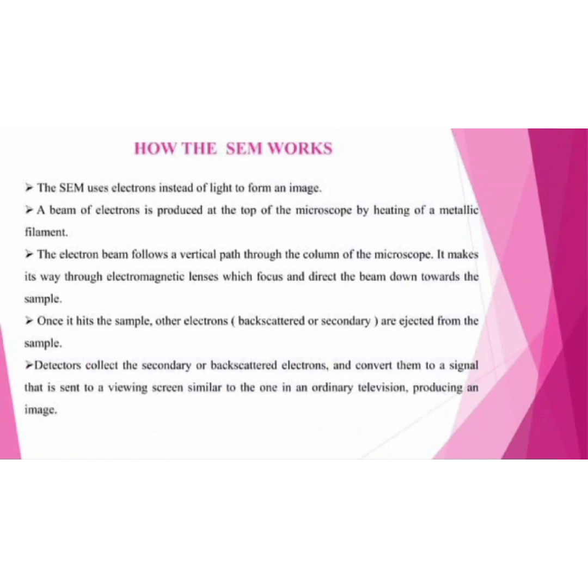Next, once it hits the sample, other electrons are ejected from the sample. Detectors collect the secondary or backscattered electrons and convert them into a signal that is sent to a viewing screen similar to the one in an ordinary television, producing an image.